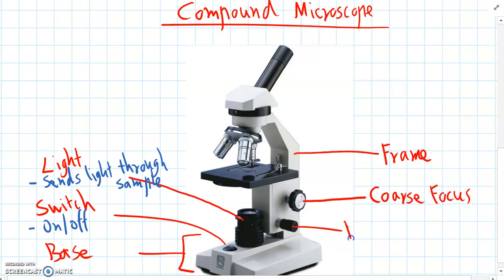And then the smaller one is for the fine focus. And both of these knobs we adjust them, and they move the slide at the top.